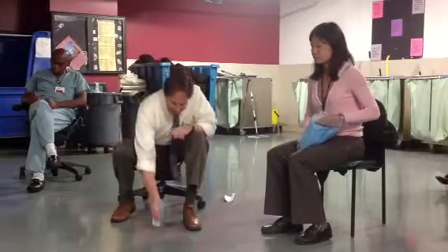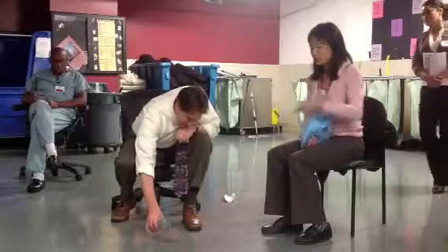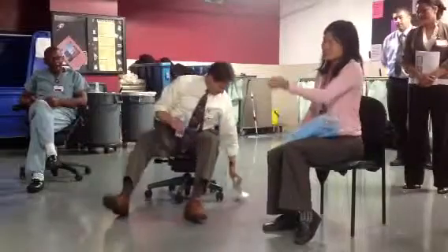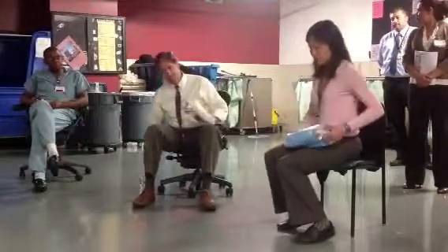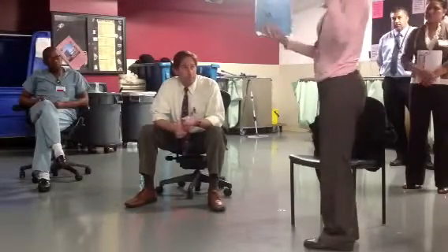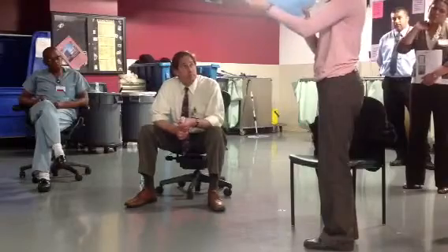This little demonstration may seem cheesy, but we have to do it. Oh no! Wow. From the IV bowl. The patient unplugged the IV and spilled on the floor, and you get called. So you need to get a chemo kit, a complete one, preferably one that's never been opened.